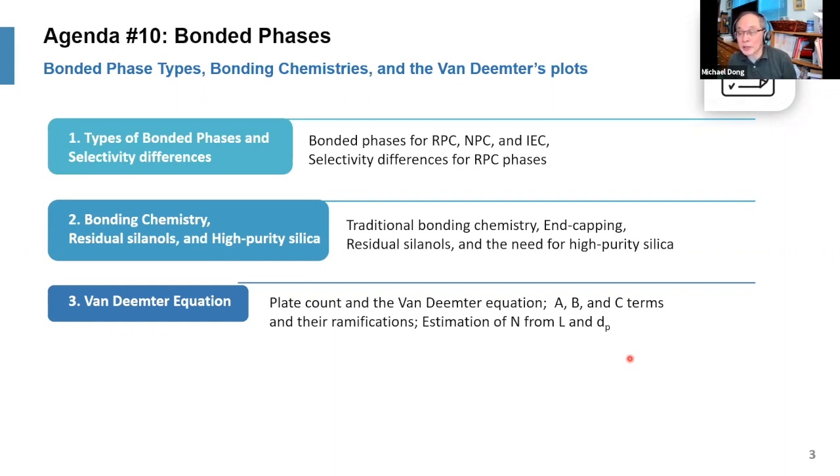You can also measure it, okay? And when you measure it and you get the efficiency plate count, right? There are many ways to measure it. You can use the USP method. You can use 4 sigma base width. It all depends on the base width in relationship to the retention time, right? And you must measure the plate count under isocratic condition.